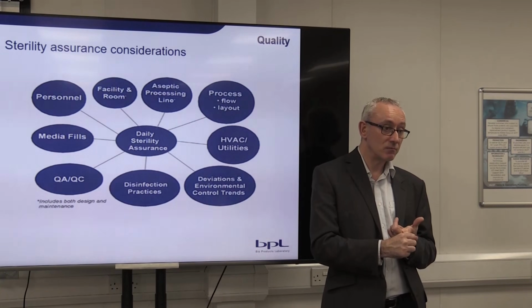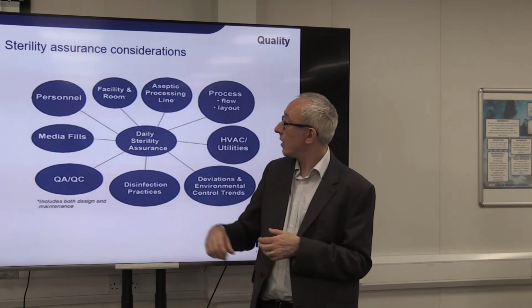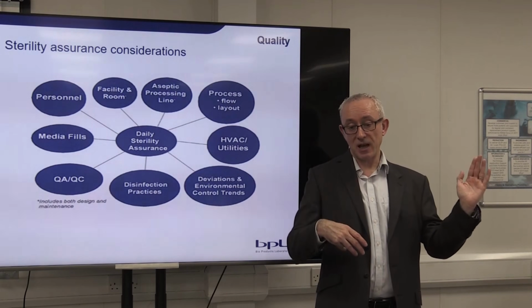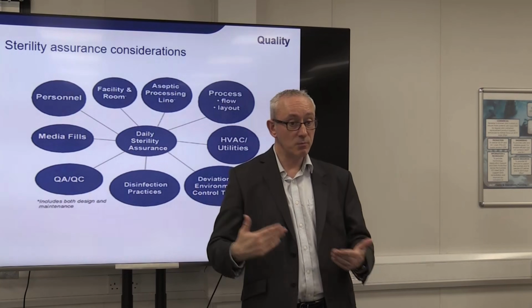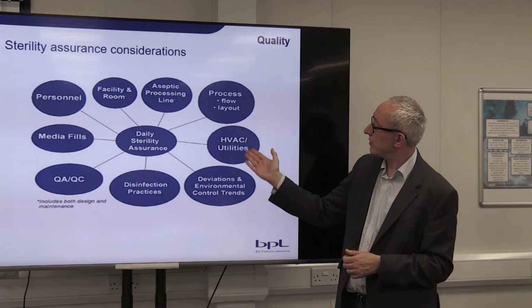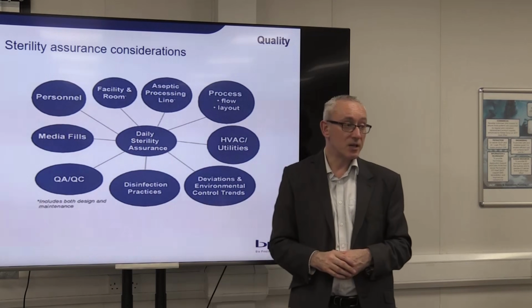Training is really important. Being trained to go into a clean room, being trained how to wear gowns correctly, being trained to clean properly. The way that the rooms have been designed, how they interconnect, is it a logical flow? So if we need to go from a grade D area to a grade C area, then we go out and we maybe change our suit before we go into that area. The importance of filling the product aseptically, the importance of having good air controls from the ceilings, and there's also the importance of running media simulations.